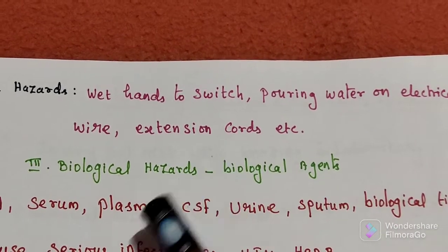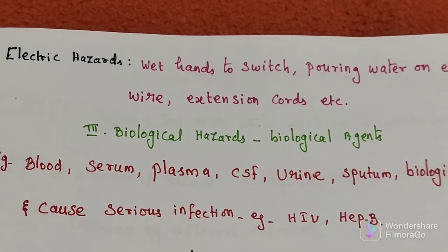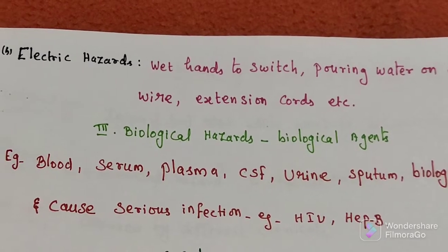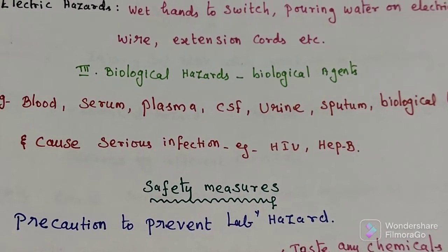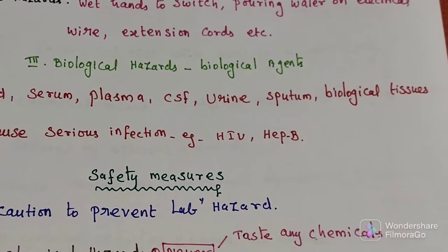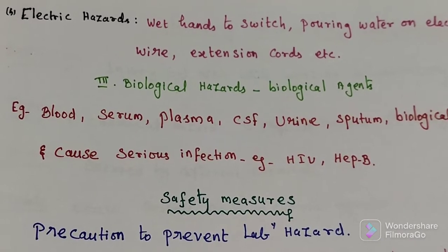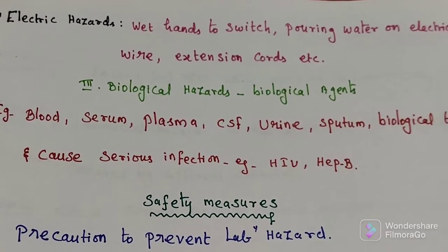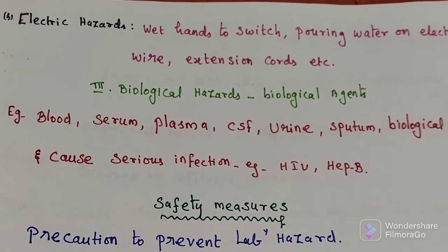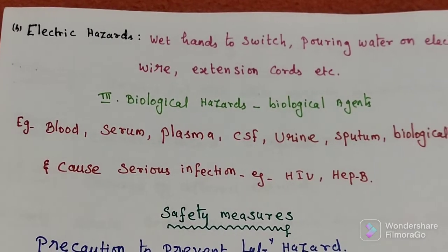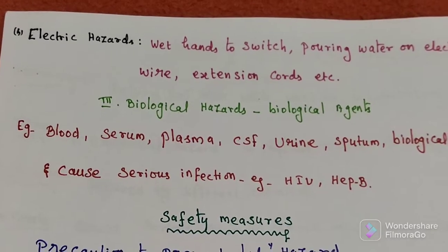The last type of hazard is biological hazard, which occurs due to different biological agents. Examples include blood, serum, plasma, CSF, urine samples, sputum, and biological tissue. These can cause serious infections such as HIV and hepatitis B viral infection.